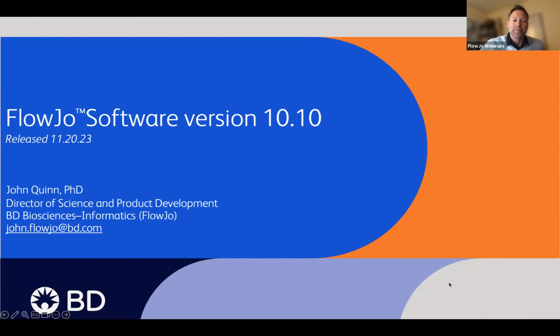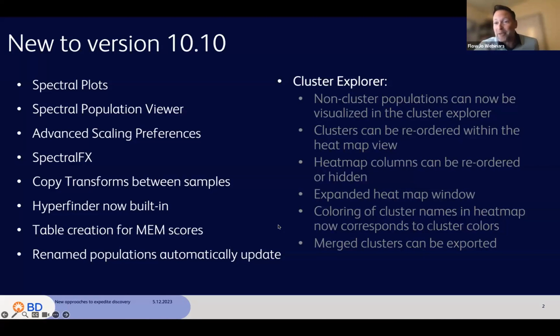So here we go. And thank you for demonstrating the chat function works and I'm paying attention to it. It's a good start to a webinar.